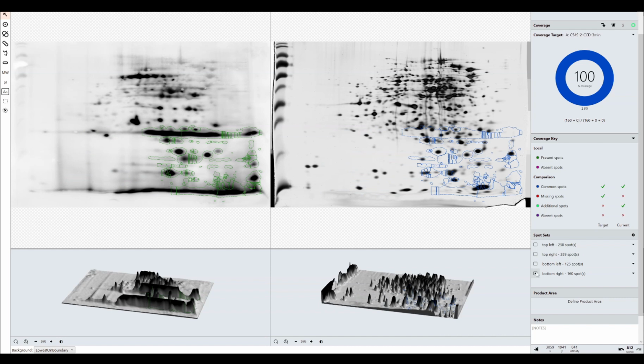You can report this kind of information very easily, and if you want to learn more about the high DPI export functions of SpotMap, you can. I've done a full video on that and how you would do that. But you can report all this information separately for quadrants.